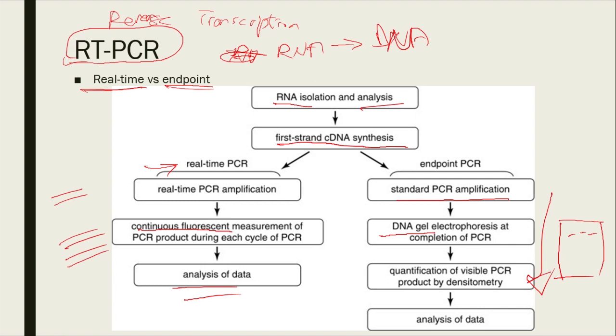But versus real time, even though the setup is a little bit difficult, with computerization and the instrument's help, you can tell the data, the analysis is much nicer. I personally have done more of the endpoint compared to real time, because I don't have a real need to, even at this point in time.